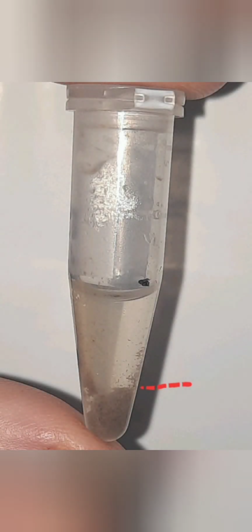The following process took place on each observation day, which was day 2, 4, 7, 11, and 14, to collect a representative population survey. As pictured here, the petri dish was tilted at 45 degrees, allowing the excess to gather at the bottom against the petri lip as runoff liquid. 0.5 milliliters of this runoff was extracted via micropipette and placed into an Eppendorf tube for the next step.